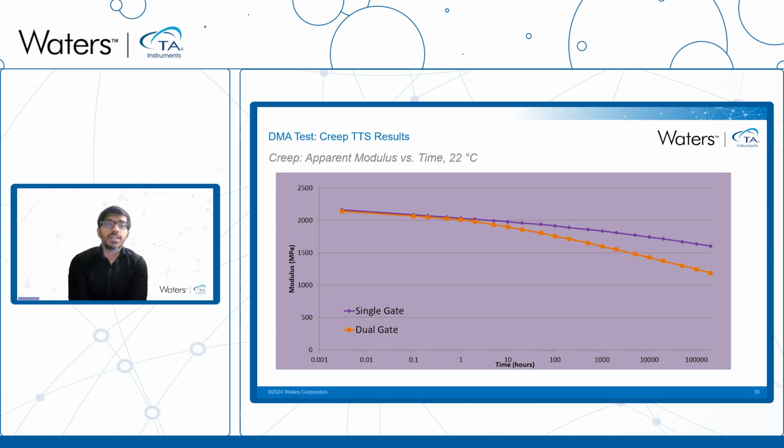If you remember, the dual gate configuration presented a knit line in the middle of the tensile bar representing a defect. This defect is also a representation of localized poor entanglement on the molecular level. The findings are consistent with the findings from the tensile testing.